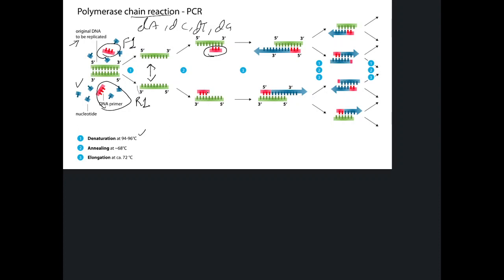These primers are then extended by the enzyme, that is DNA polymerase, and this DNA polymerase could be a Taq DNA polymerase, it could be a Vent DNA polymerase, Turbo DNA polymerase, or any DNA polymerase depending upon the user's use. After this, your PCR cycle starts running.